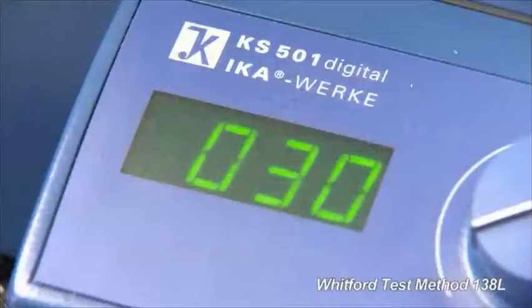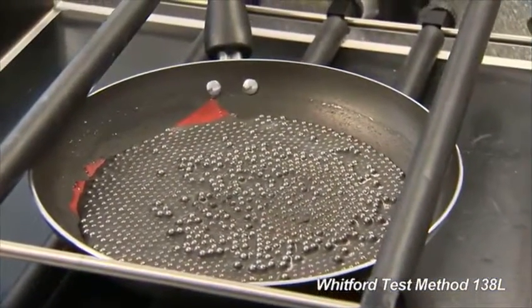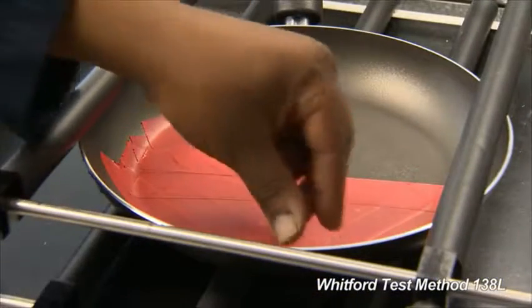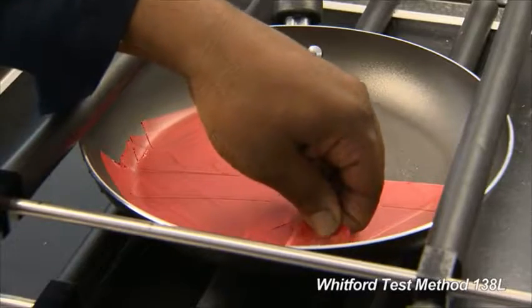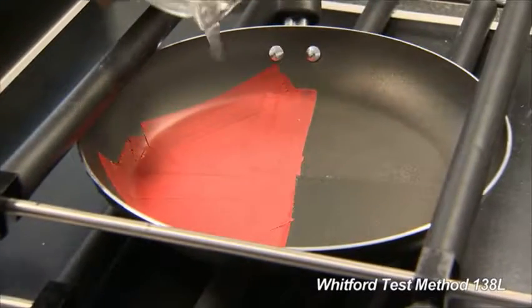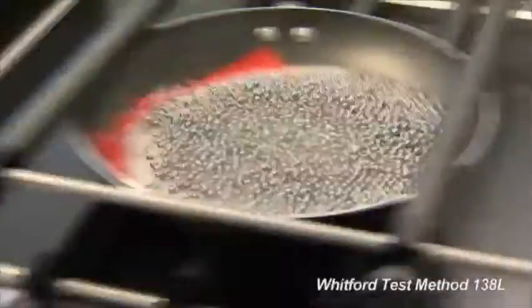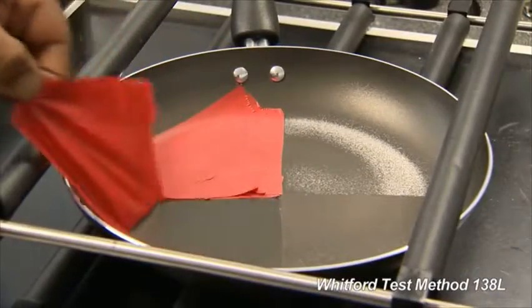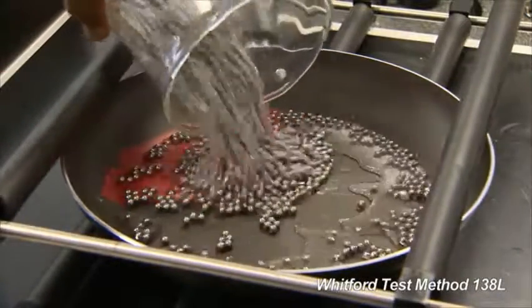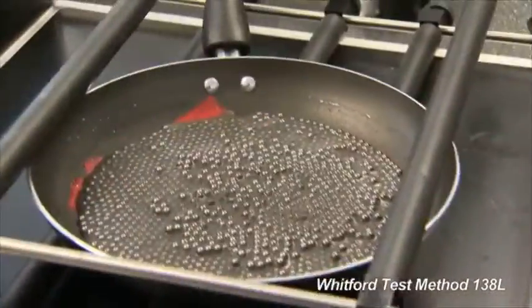Stir the abrasive mixture. After 15 minutes, turn the shaker off. Empty the pan and remove the first covered quarter. Repeat the test for another 15 minutes, then a third 15 minutes, at which time the test ends.